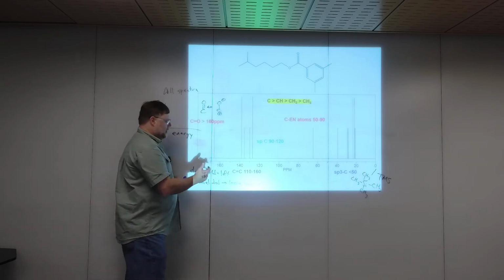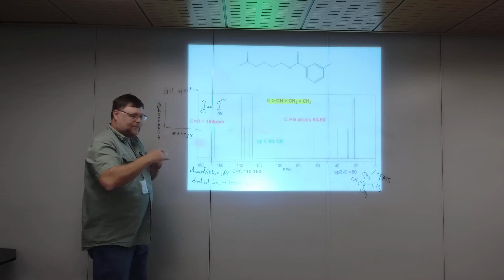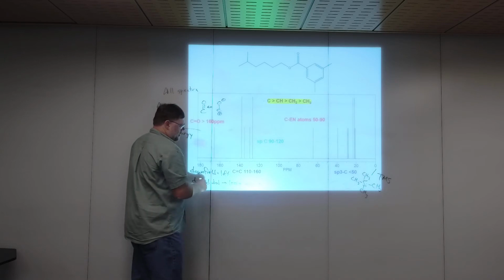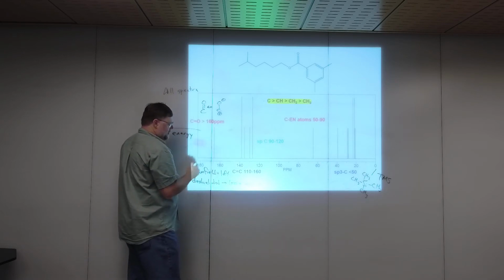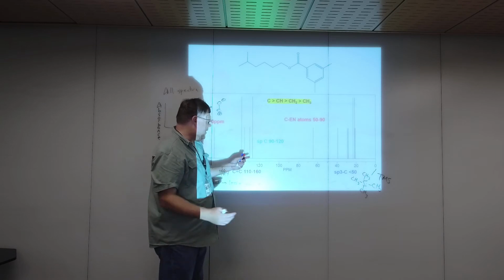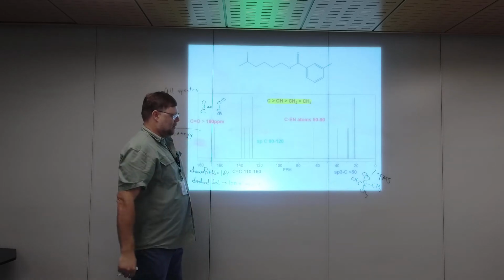And then again, down sort of 110 to 160-ish, carbon-carbon double bonds. And again, the peak strength is not that useful right now. You just want to note that you've got peaks. So carbon-carbon double bonds are just a little bit upfield to the right of a carbonyl. This molecule doesn't have any sp carbons, but if you did, it would be somewhere here in the middle. Down on the right are going to be sp3 carbons, right?